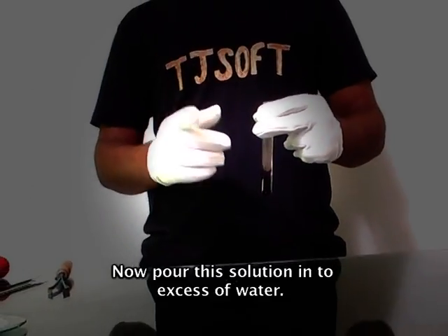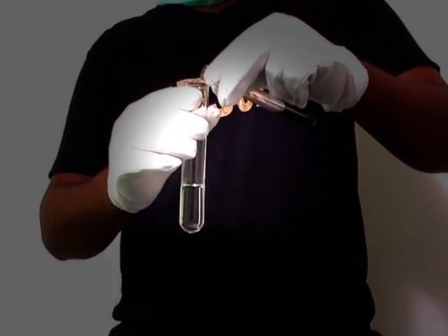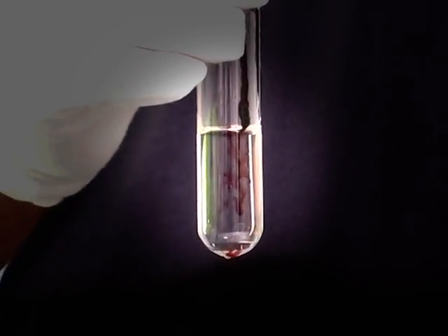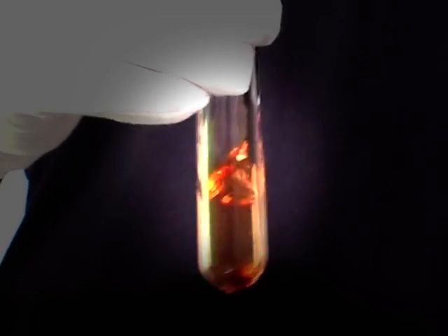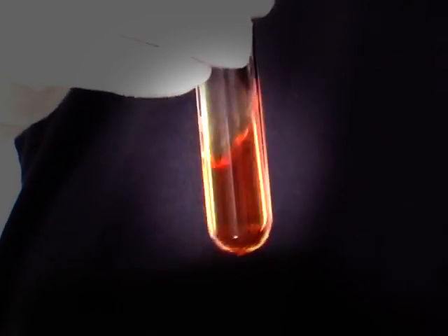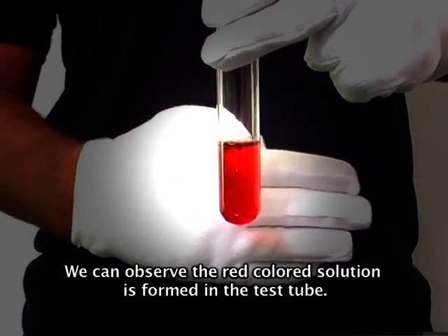Now pour this solution into excess of water. We can observe that a red colored solution is formed in the test tube.